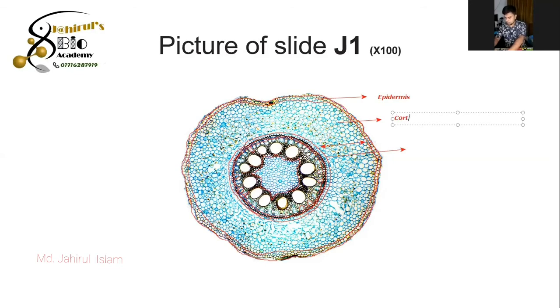then cortex, endodermis, okay, and xylem and phloem are in the center.